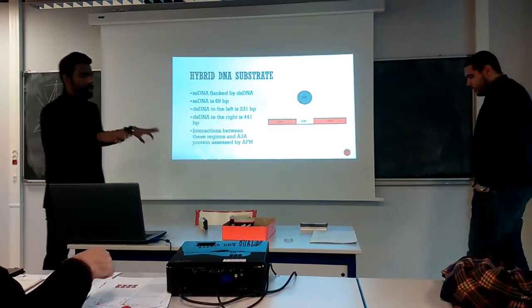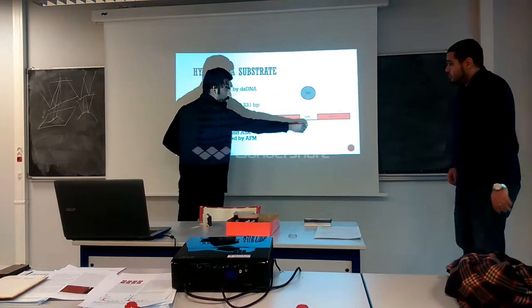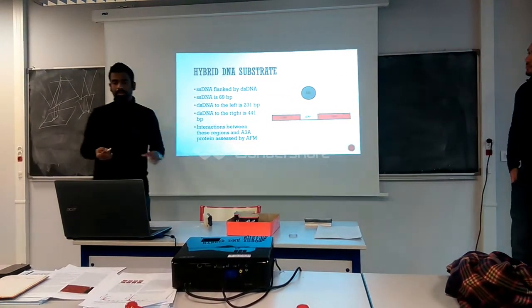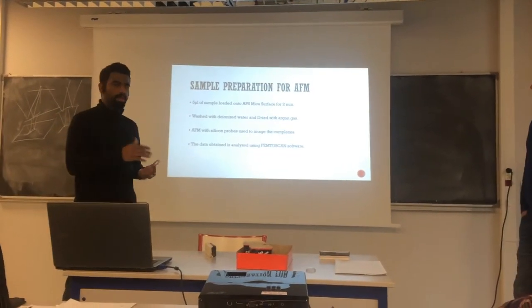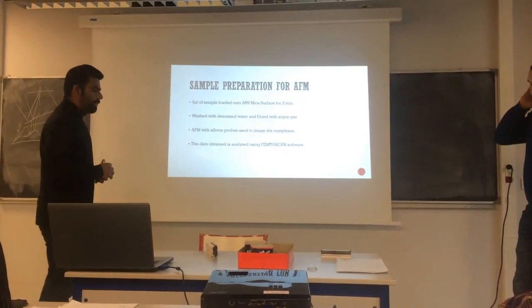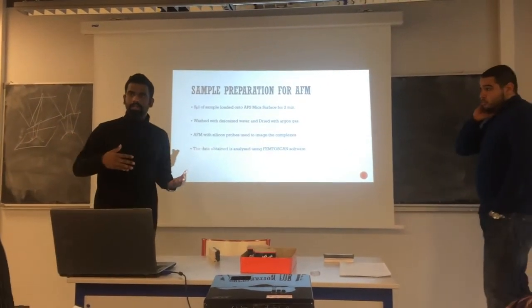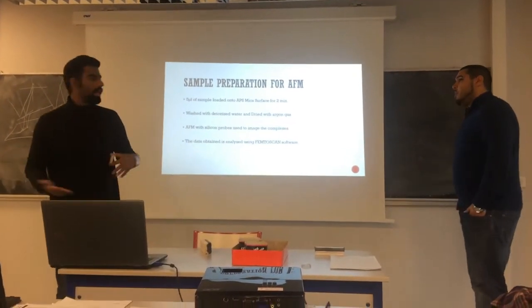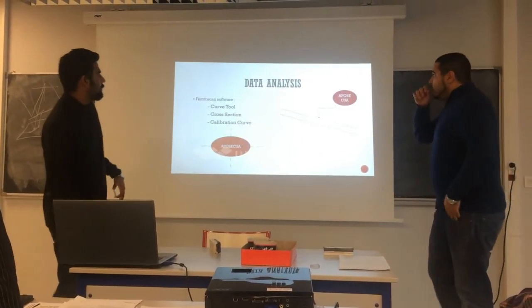So the whole experiment of atomic force microscopy is going to determine whether A3A binds to your single-stranded DNA, or to the double-stranded DNA, or to both. They rinsed the surface with deionized water, and then they dried it with argon gas. And then they used the AFM probes and saw what exactly happened. Is A3A bound to the single-stranded DNA or the double-stranded DNA? Next comes the data analysis, which my colleague Sofian will explain.